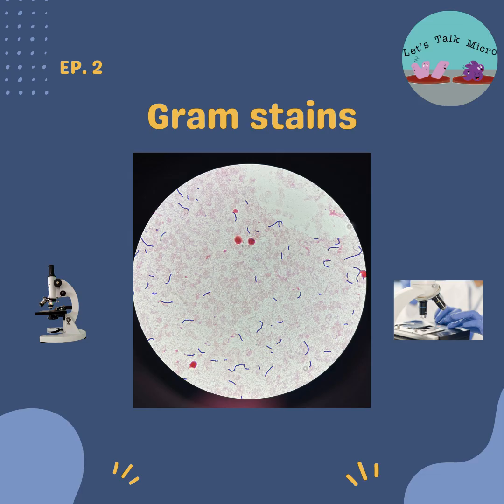And then if you have body fluids, like I mentioned, we cytocentrifuge them. We put a slide on a funnel device, and you can Google that. I mean, if you're in this field, you know what a cytospin slide is. By adding a few drops of this fluid, you are bringing the cells together. You're concentrating that sample so you can see it better.